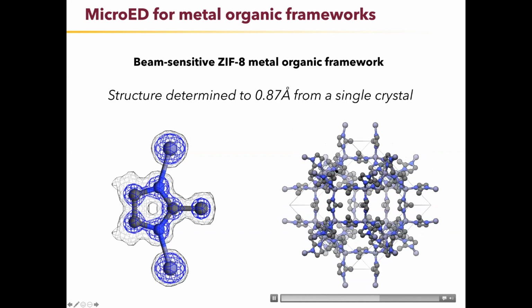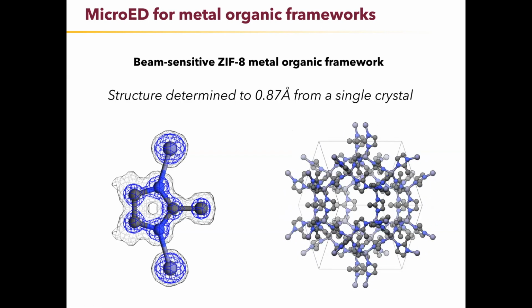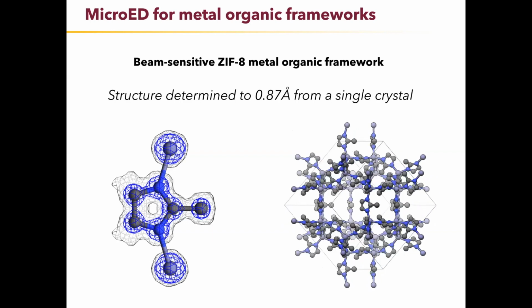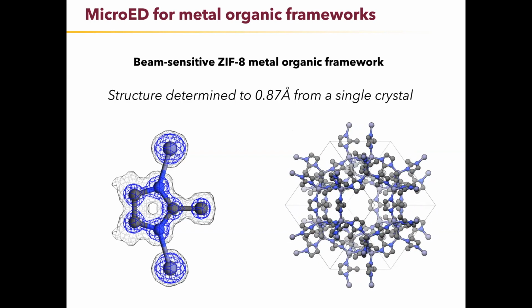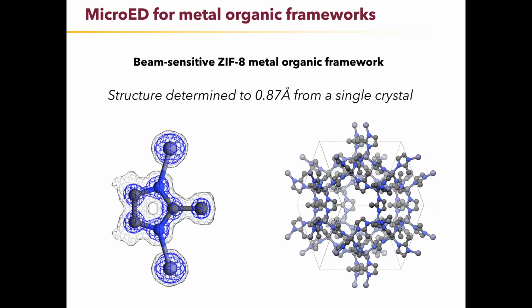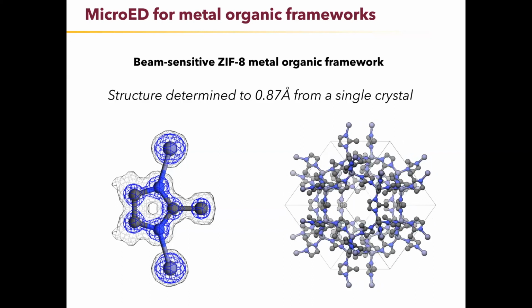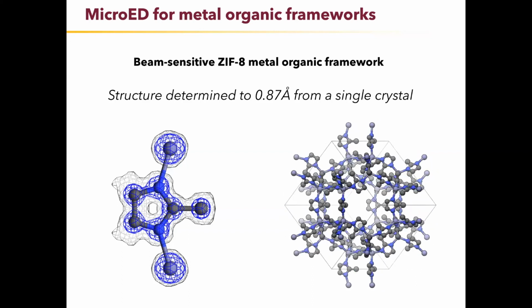This is with our collaborator here at ASU, Jerry Lin, who's an expert in these materials. We've also solved 2 or 3 other of their samples, a couple of them unknown, where they synthesized the materials, collected powder X-ray data, and showed that it didn't match anything they had made in the lab before. We were able to just go in with MicroED and relatively quickly solve the structure for them. So it's been a really fun collaboration, getting into the material science aspect of things as well.